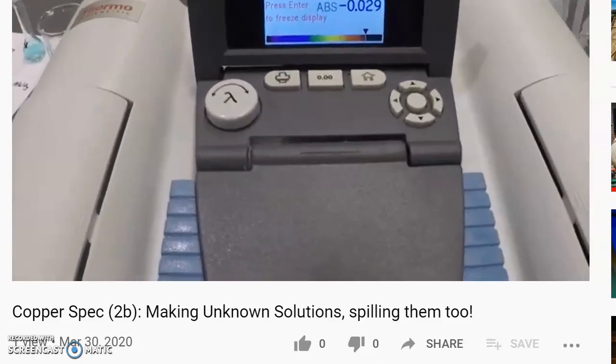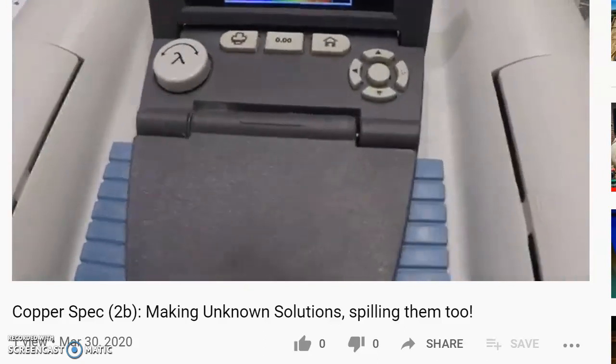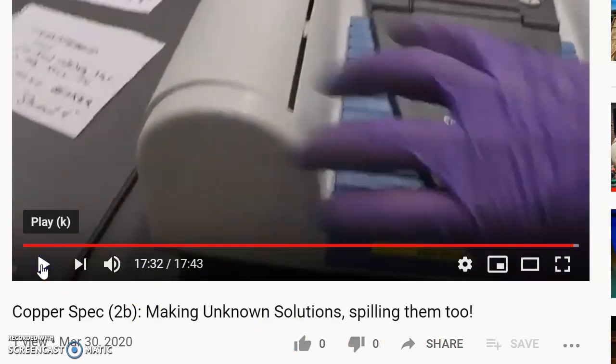Same thing, we've already zeroed our machine, our instrument, and we can record the absorbances from there. And I'm just going to pause this and give you the absorbances. So absorbance for A is 0.667. Absorbance for B is 1.42. Absorbance for C is 0.584. And absorbance for D is 1.035.